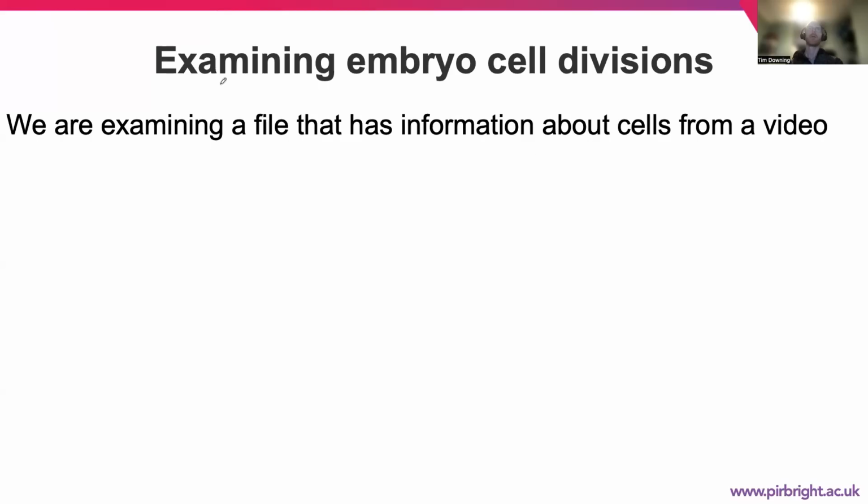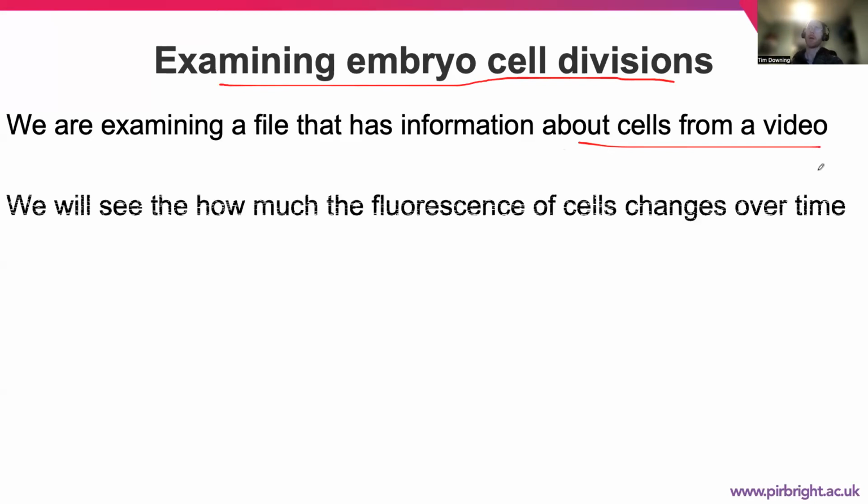So in this extended demonstration video number 5 in the course Bioimage Analysis, we'll look at fly embryo cell divisions over time. So looking at a series of images, a video of time-lapse images over time, looking at fluorescence of different cells and tracking the movements of these cells over time that are deciphered as spots that are of interest.